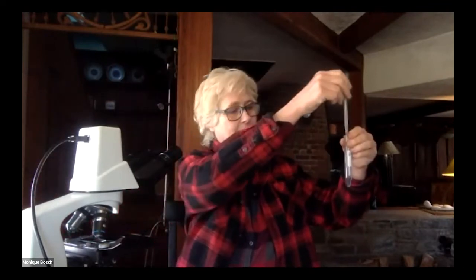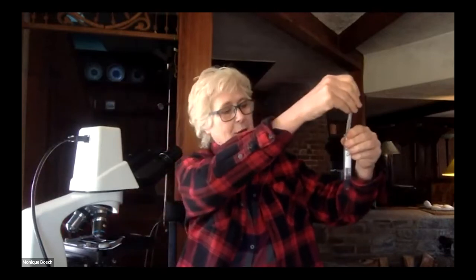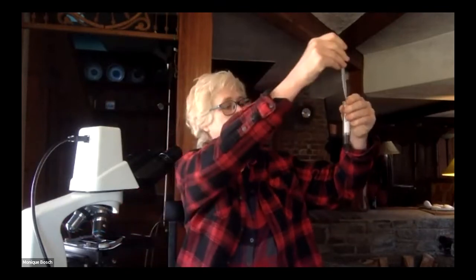And then I have distilled water over here and I fill my pipette and I'm going to do a 1:5 dilution, which is basically 1 gram to 4 grams of water. And that's what they call 1:5. I call that 1:4, but I'm not. All right, so there is our solution. And I put the lid on, and then I do the same process regardless of what it is, any type of soil or compost. And so that you know it's been mixed the same amount of time. So this is how I do this.